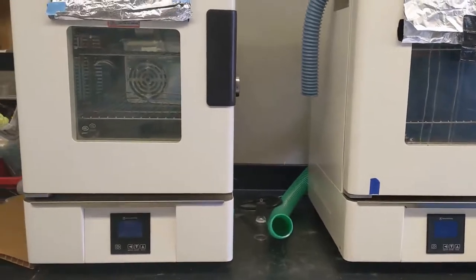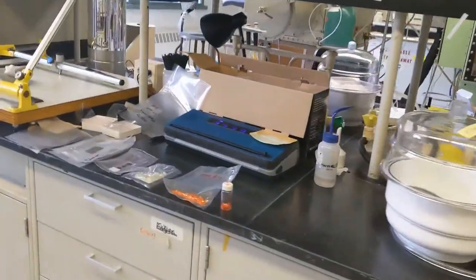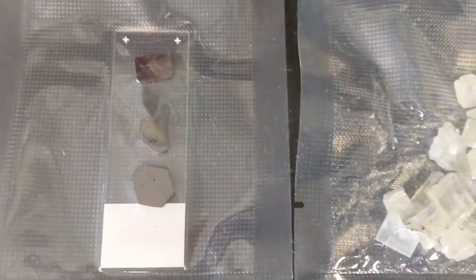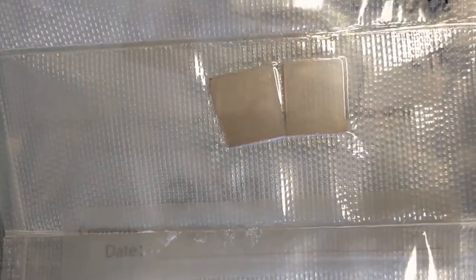We also have the spin coater and hot plates to make films in a glove box as well. We have some more cool gadgets to help grow bigger hybrid halide perovskite crystals, like these furnaces and another station for crystal growth. Going through all these steps, you can see the kind of hybrid halide crystals we get — which are pretty nice, big, and beautiful. These are, for example, methylammonium lead chloride and methylammonium lead iodide, as well as films of these materials made in our lab.